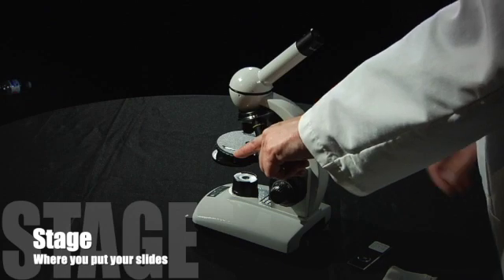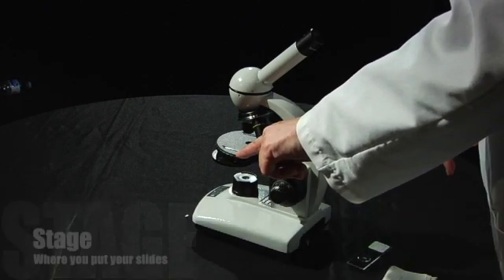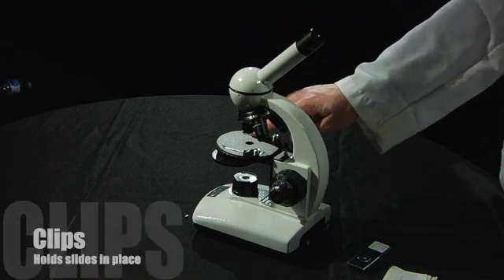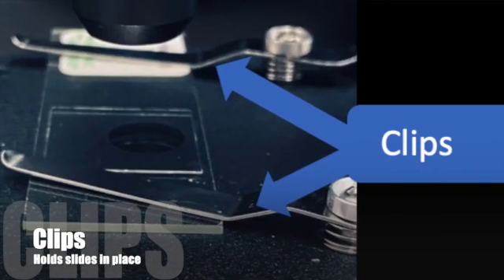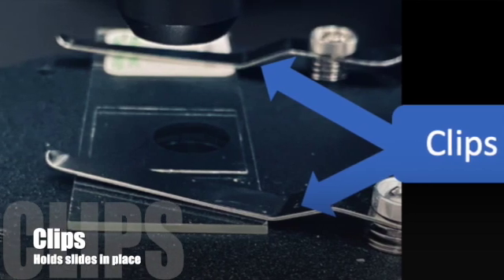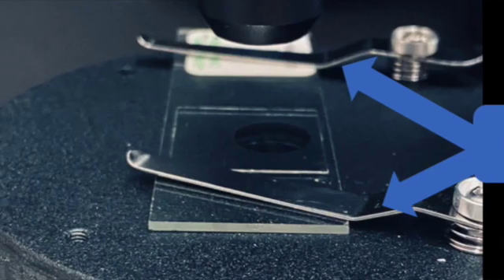This is the stage, and the stage is where you put your microscope slides. Next we have the clips, and the clips are what you put your slides underneath to hold your slides steady and to make sure that they don't slip off and fall down and break.